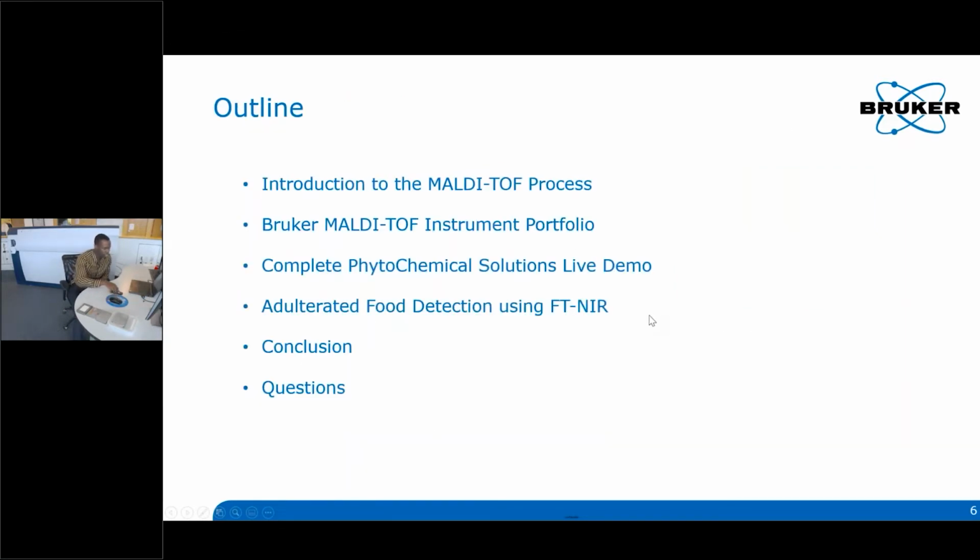So before we turn over to Chris Krueger, I want to show you one of the sample targets that I was working on that I prepared already. I'm going to show you how easy this is to insert it into the instrument.